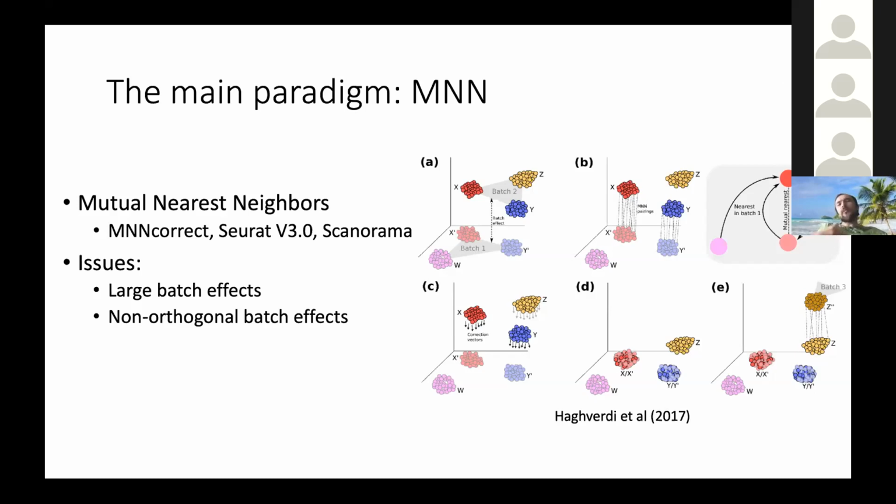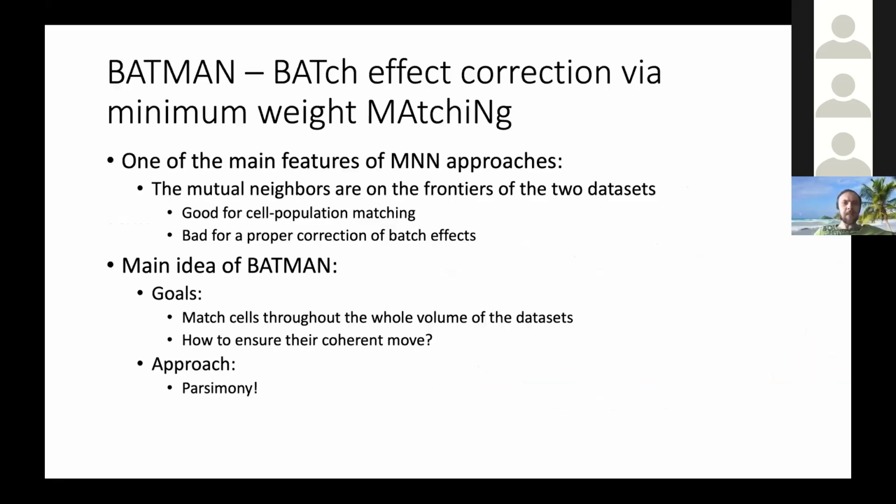The issue that was identified even by the authors of the paper is that the MNN correct approach is vulnerable to large batch effects, or when the batch effects are non-orthogonal to the biological signal. I'll talk about these problems later in my slides.